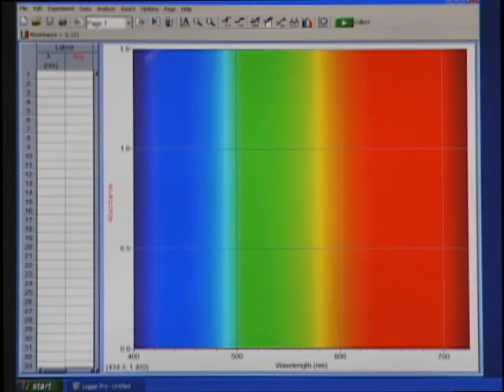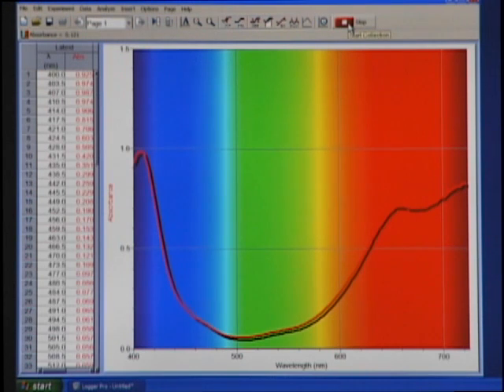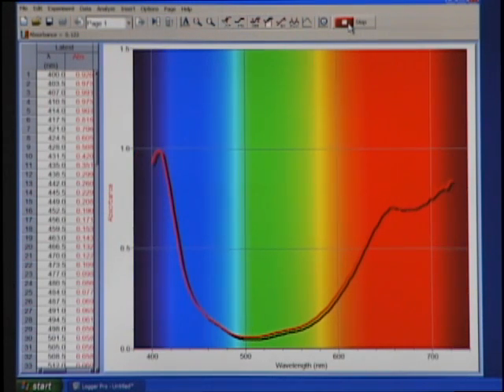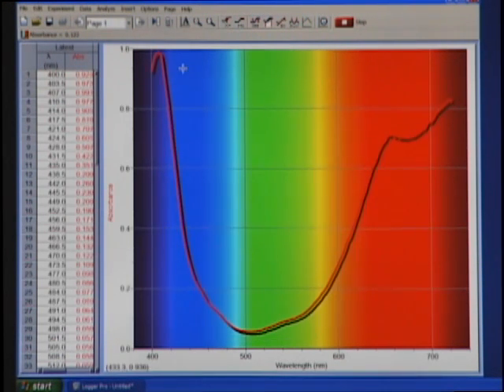We're already in the full spectrum mode, absorbance versus wavelength, so I'm going to go ahead and click on Collect. When I do that, in less than a second I have a full spectrum, and I'm going to click on Autoscale just to fill up that graph, fill the graph axes a little bit better, and I'm going to go ahead and click on Stop.